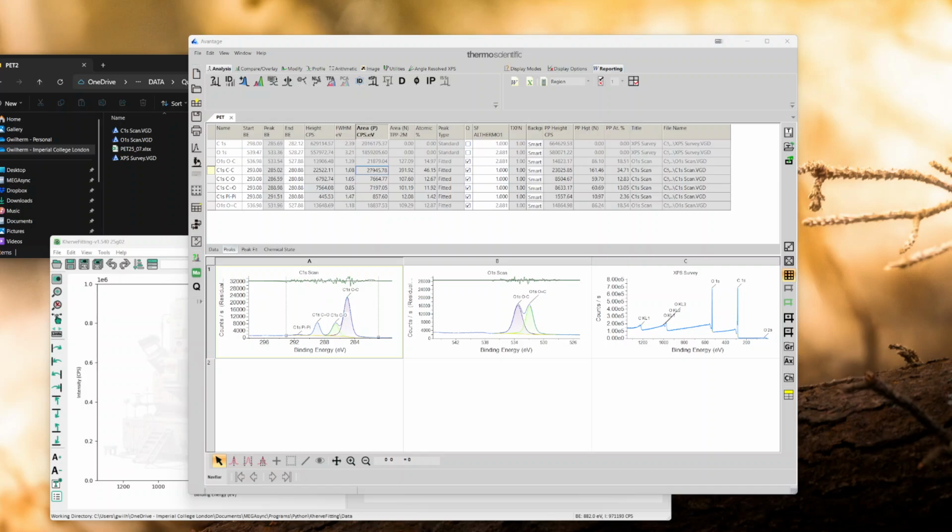In this video, we will try to compare a PET sample using Avantage and using KherveFitting. And we will export the data that we obtained in an Avantage Thermo instrument into KherveFitting.